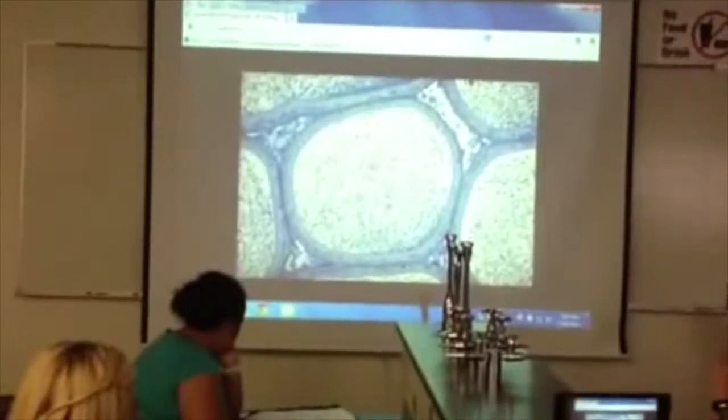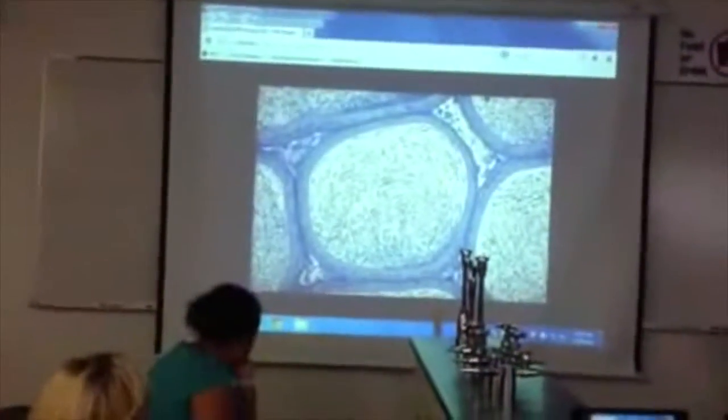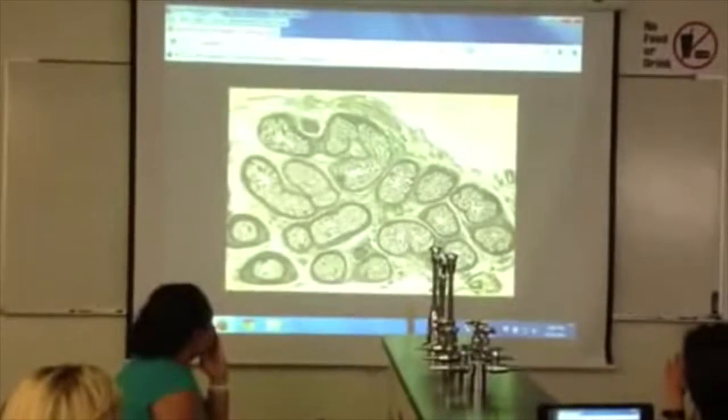Are those some sperm there in the interstitial? Yeah, it's sperm. They're actually moving around there. No, that shouldn't be out there. They should be in there. Classification, so it's a little different.